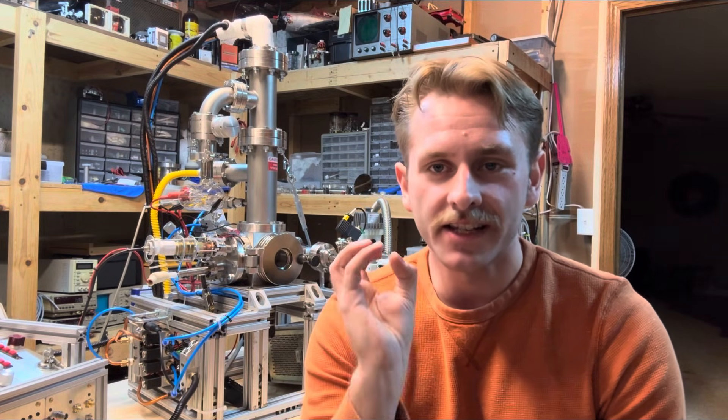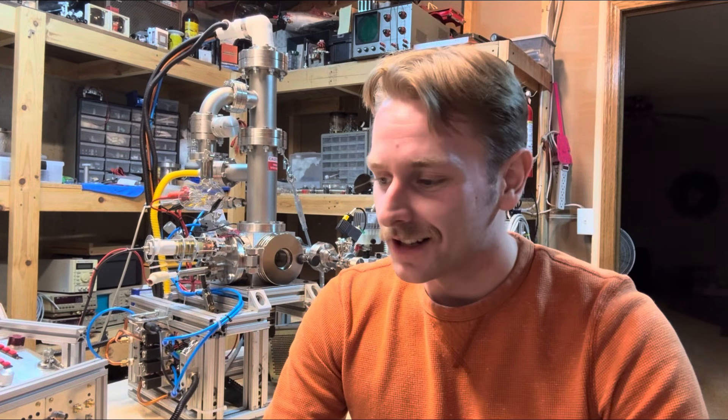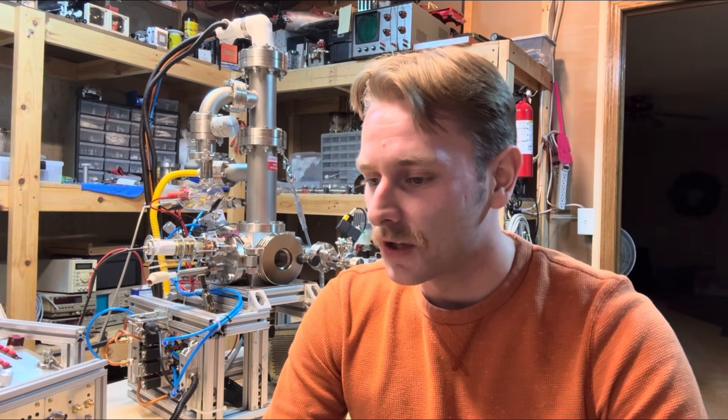There's a lot of reasons why I want to do everything digitally, because then I can keep track of any inaccuracies that are happening. I can really itemize everything in the microscope and get the most predictable performance out of it.